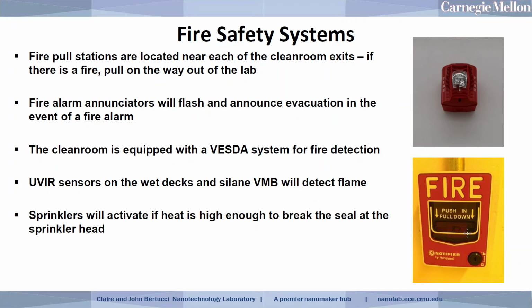Parts of the clean room have automated systems that will detect flames and try to extinguish them by dumping CO2, for example, into the wet decks. So that might be something you see if there was a fire or a heat event inside the clean room. We also have a sprinkler system in the lab, and that will activate if there's enough heat to actually trigger the sprinkler heads to pop.